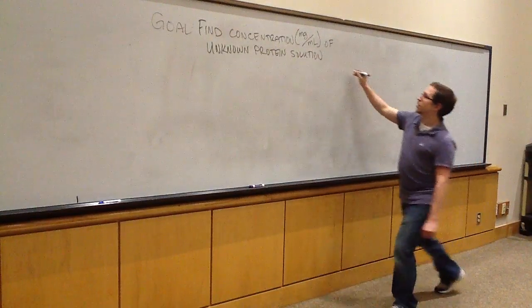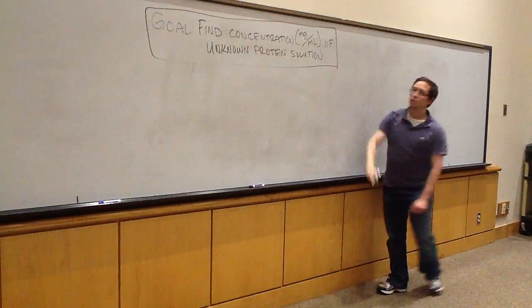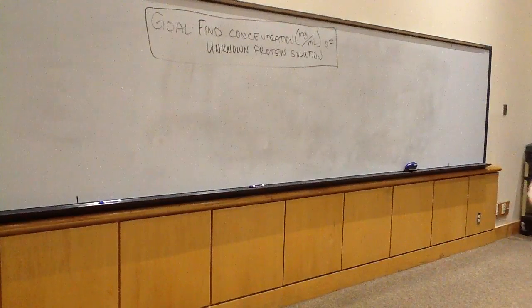That's our goal. I'm going to box this in so we can just keep this in mind at all times. Now, I can take that unknown solution at any time during the lab and put it into the spectrophotometer. And that's all well and good.